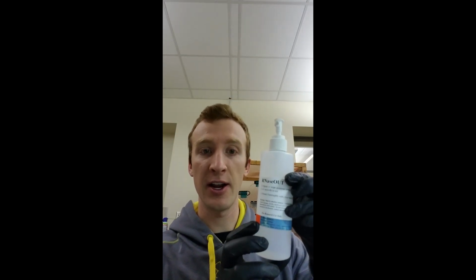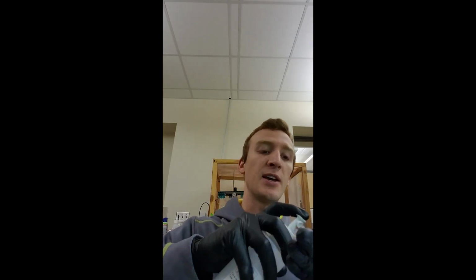After pulling a tip, but before using it on the injection machine, you first have to clip the tip to the correct diameter. So I'm going to show you how to do that now. The first thing you have to do is RNase out your hands. So here's a bottle of RNase out. You do this because the needle or the glass tip that you're using is going to be holding RNA, which is easily degraded. So you clean your hands. It's okay if it's still wet, it's fine, before you touch the needles.